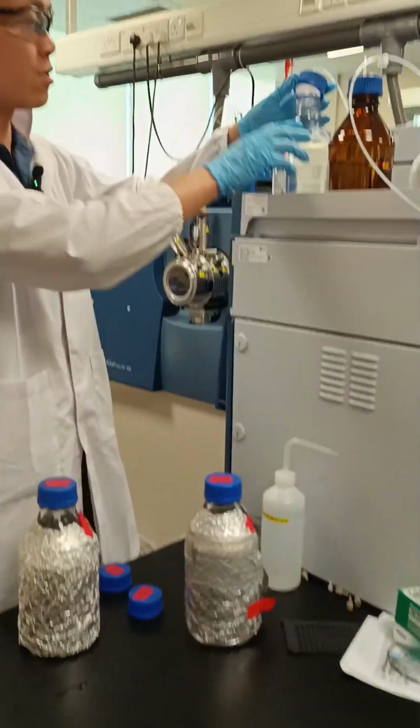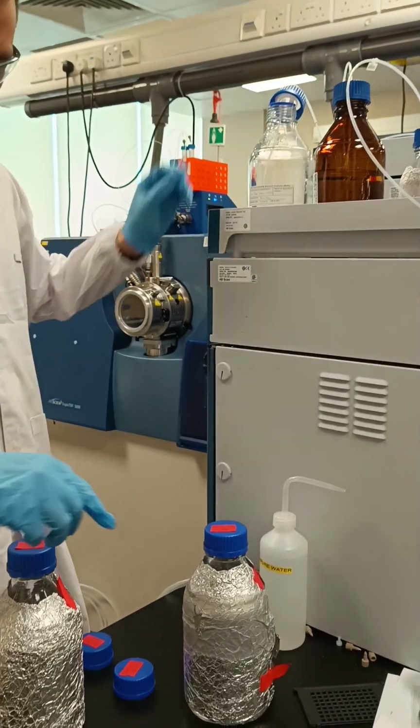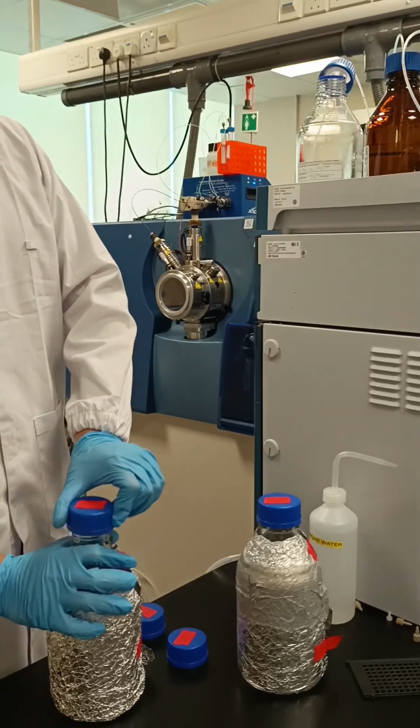So now we're going through the second step of purging. Basically, you change the pure water to another pure water, except we add 0.1% FA, formic acid.